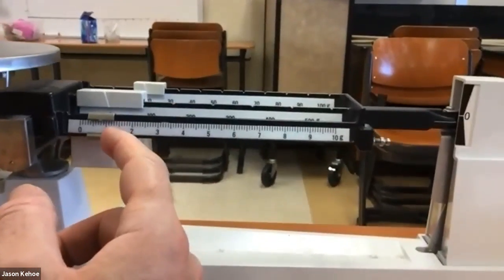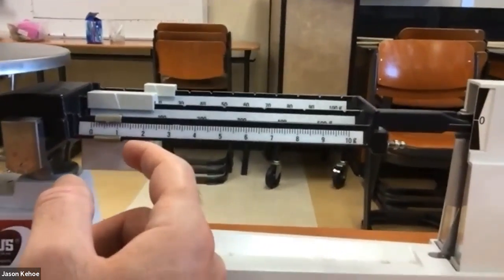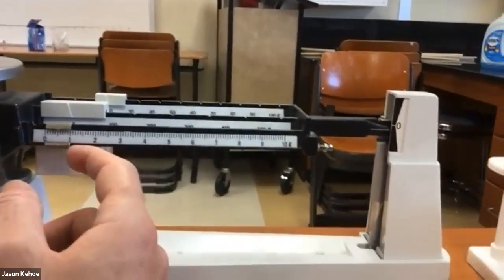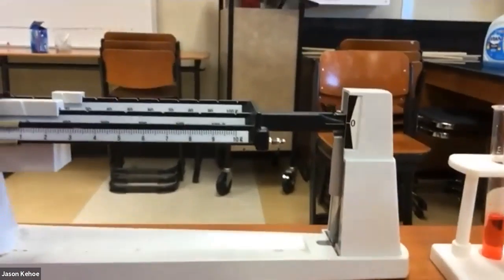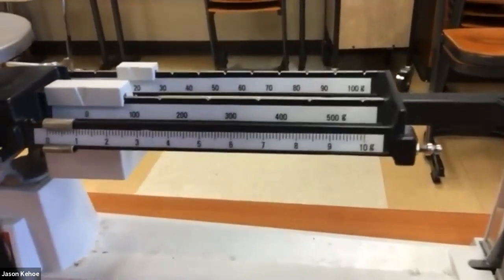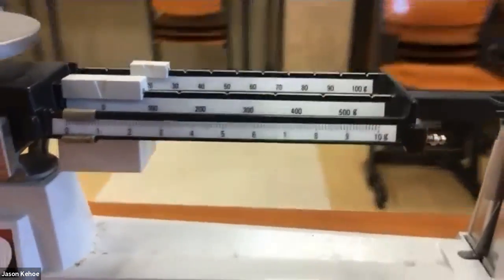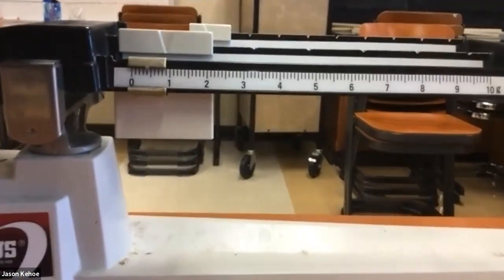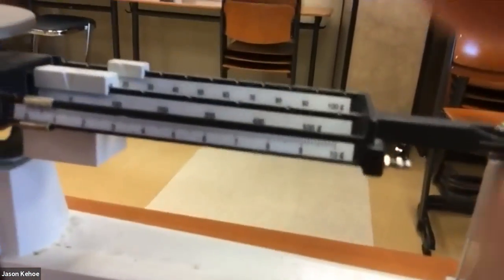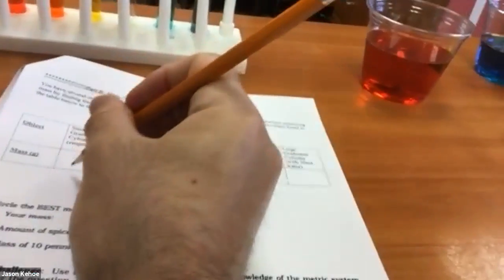You've got to be gentle with this so you don't move the arm around just with your finger, until this balances, till that arrow points right at that line. So this small graduated cylinder appears, you add up the 3 rows: 0 from the hundreds place, 20 from the tens place, and it looks to be about 0.4 in the ones place. So this small graduated cylinder has a mass of 20.4 grams.